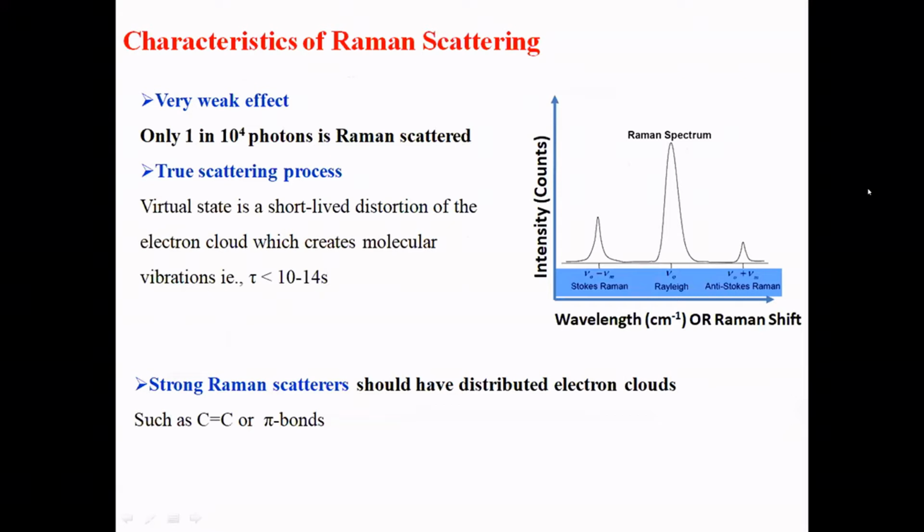Why are we saying it's a Raman shift? Because it comes with a particular frequency because of the molecular structure or the vibration level. So it undergoes the shift process, the wavelength getting shifted. That shift is very key here. We get that information in terms of wavenumber, and we plot it against the intensity. This is a typical denotation of a Raman spectrum: a wavenumber with a particular frequency versus the intensity.